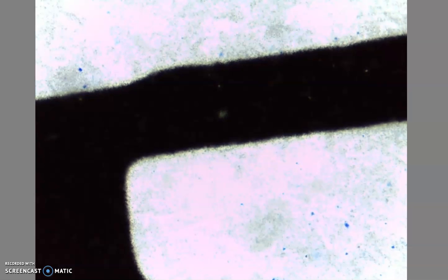So with the E, it's just part of it. It's just one small line in this case. So we lose the whole picture, but we gain more detail on some parts of our object. And this actually ties into one of the last experiments or procedures you do in this lab, which is about depth of field. We lose the depth of field.